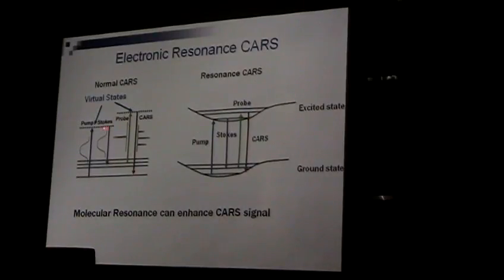Here, one aspect is that, like Raman, this upper state here is a virtual state. You don't have any actual real state there.